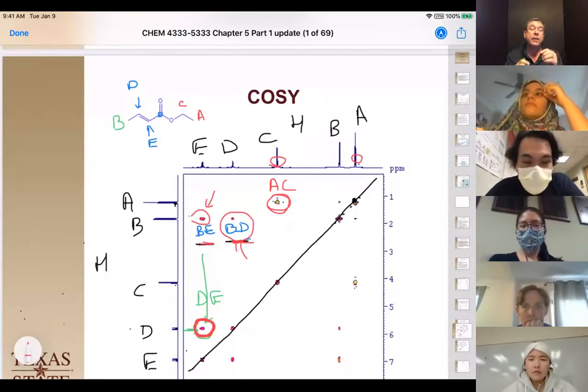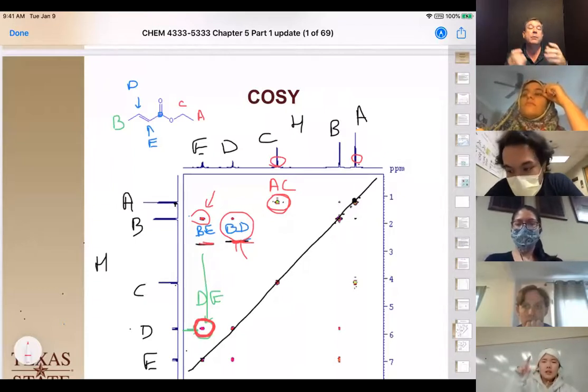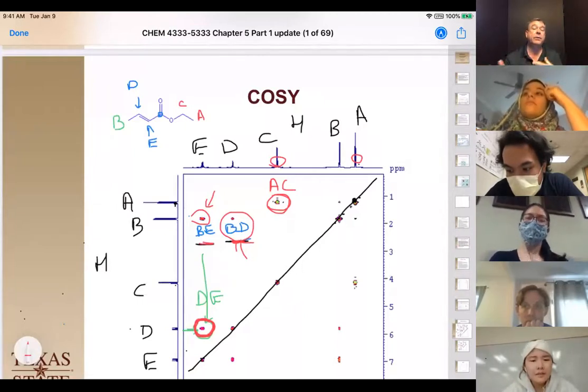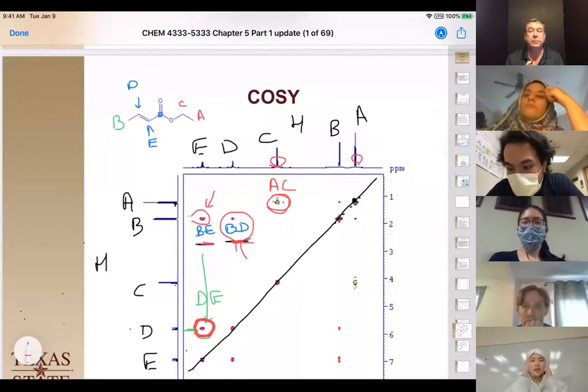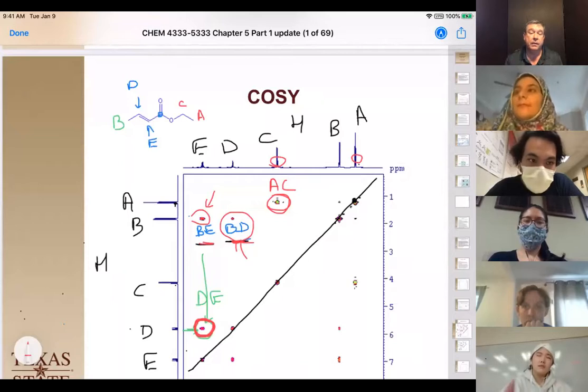And so these spurious peaks are actually more likely to be removed in modern machines than not. So we might not see them on other future ones, but this is an old example. So I think that we just have a phase issue in this particular example. But overall, we should see a direct correlation between that 3-bond interaction.